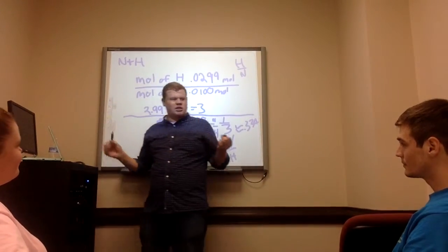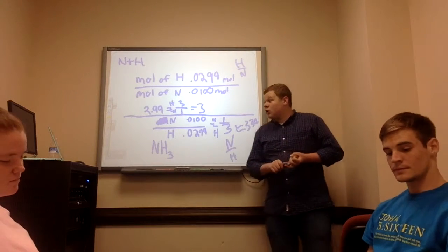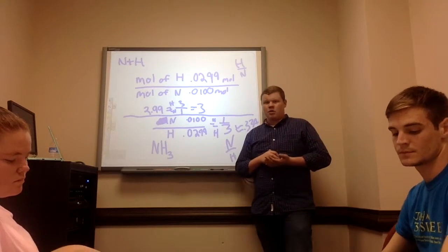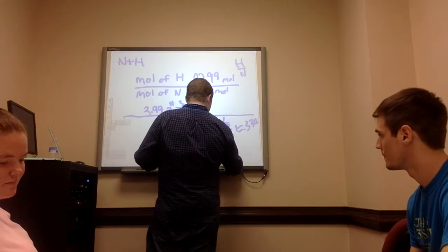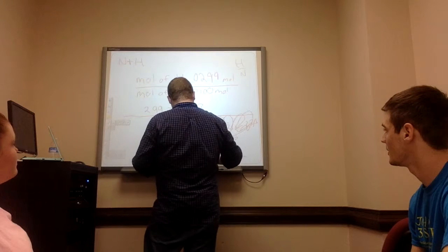So there's 2 parts to this experiment that you all are going to do today. In part A, you will determine the chemical formula of a compound that is composed of only zinc and iodine. What's the chemical symbol for zinc? Zn.